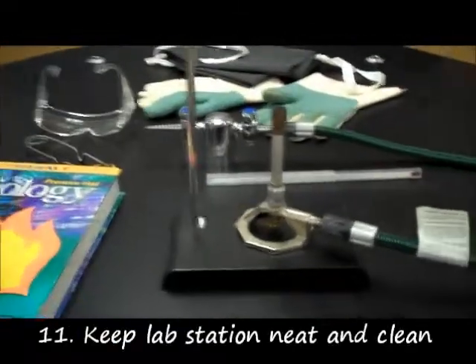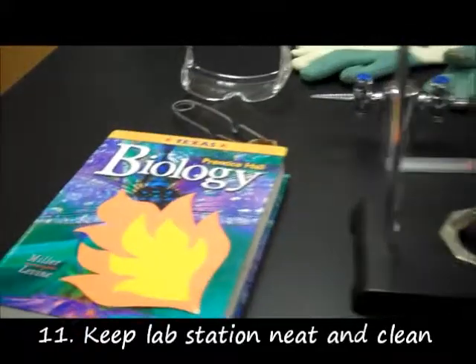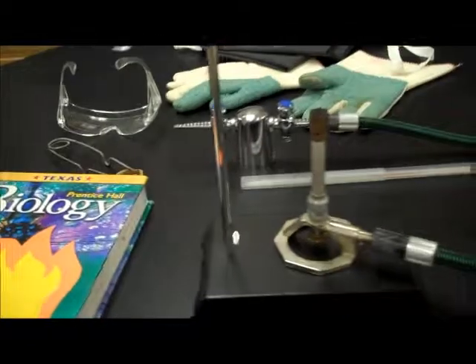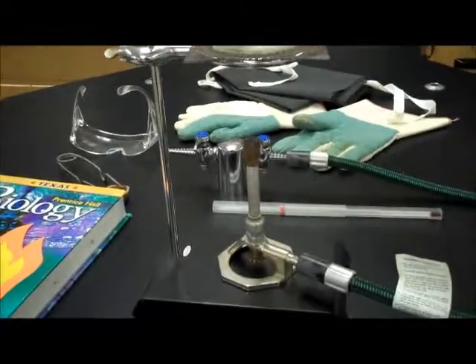In this situation, a book was sitting too close to the Bunsen burner and it caught on fire. In this situation, it's important to remember that you should keep your lab station neat and clean, and things that don't need to be at your lab station should be left at your desk. This way you won't have anything too close to the fire, and you'll be able to work with the fire safely.